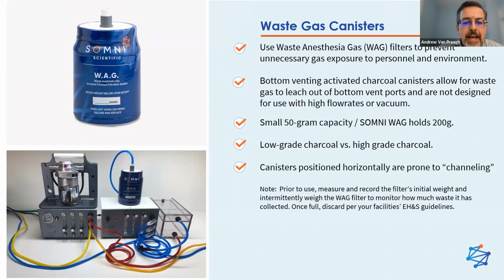So as a user of the Somni AMD3 and EPS3 system, this is how I normally see it. And it's really a very capable system in the following sense. As Tim has gone through in detail, I will summarize. You have 3 lines of supply and 3 lines of evac. You can set the flow rates as you wish. And then once they're set, you can use the flip switch to basically turn them on and off on the supply side.